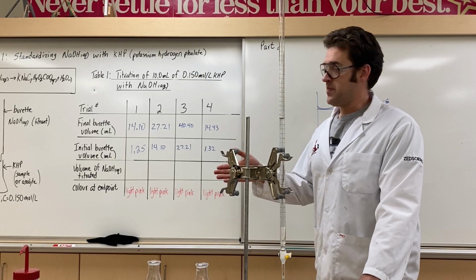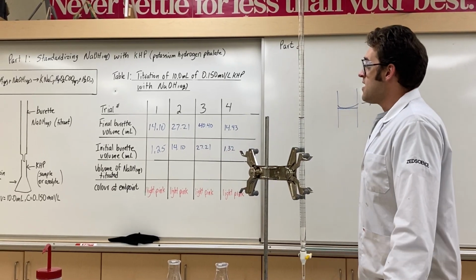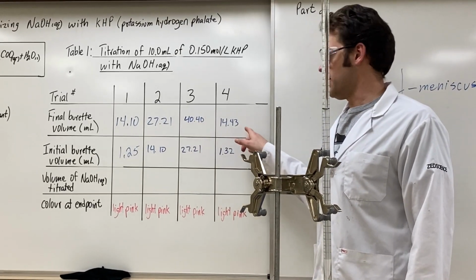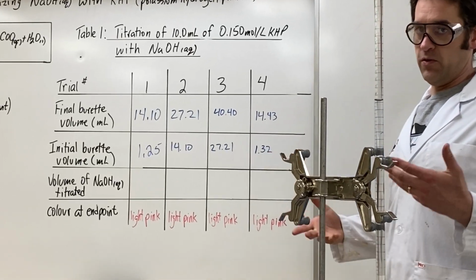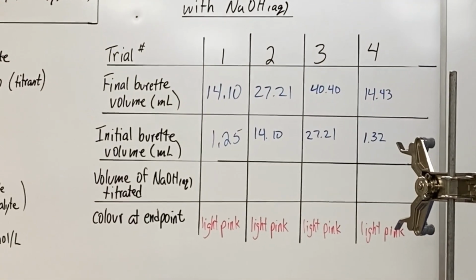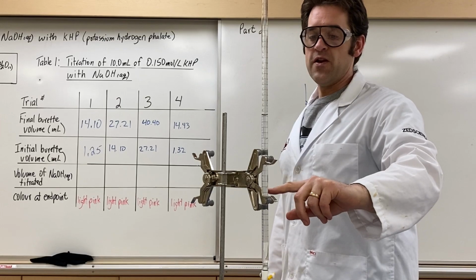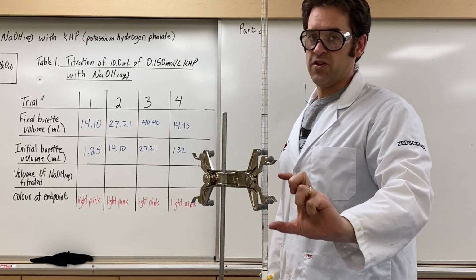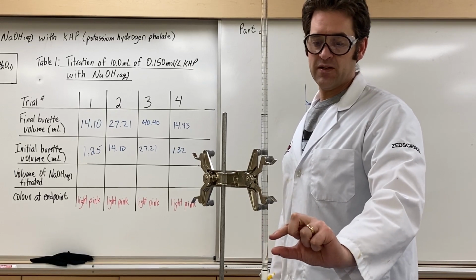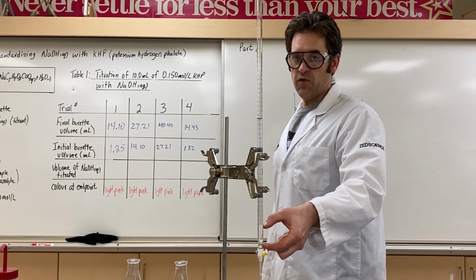Okay, we didn't show you, but we did some subsequent titrations. We did 4, and we actually ran out of sodium hydroxide, so we had to refill the sodium hydroxide because it only holds 50. So this is another lab skill that I've seen some students forget about, is they use so much of the sodium hydroxide, they get so down low that they do another trial and they don't have enough to use, and they go below the last gradation lines where there's no measurement. So if you use into this danger zone here, you have no idea how much volume you used.